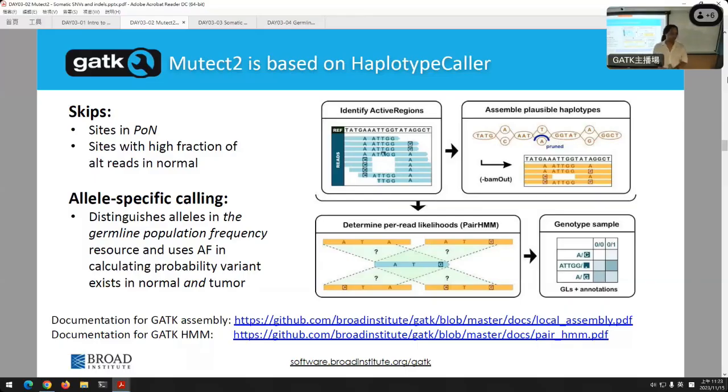Okay, so the question was, when we're using HaplotypeCaller behind the scenes, which is based upon a certain assumption of what the actual genome might look like, does that cause issues when dealing with cancer cells? We make other tweaks to HaplotypeCaller here. There are a series of tweaks. One is, of course, the different thresholds that we apply to germline. We also change the part where we compute our likelihoods and call variants based on that. I know functionally what they do there.